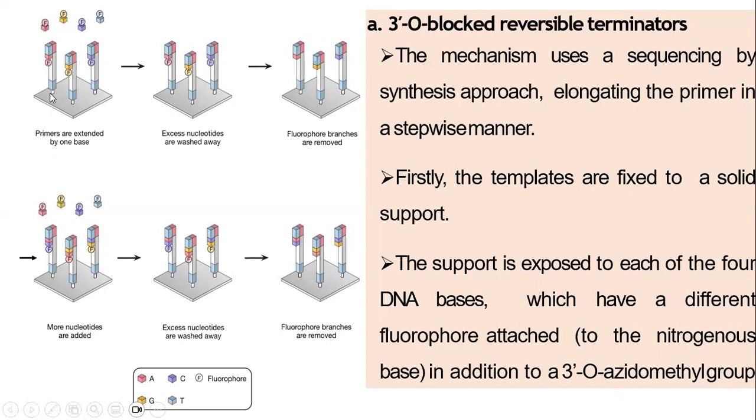Now in each cell, depending on the template, the correct base will be added, and it will give a different type of signal.